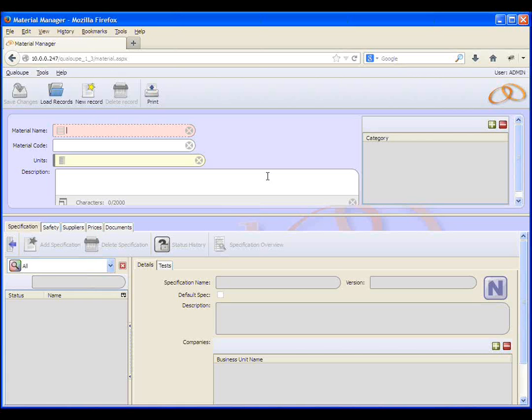For example, a set of tests to use for calibrating an instrument or something like that, or background tests in your lab. You might do a weekly set of swabs around a micro lab just to ensure your background contamination level is low, so you might just gather those together into a material.